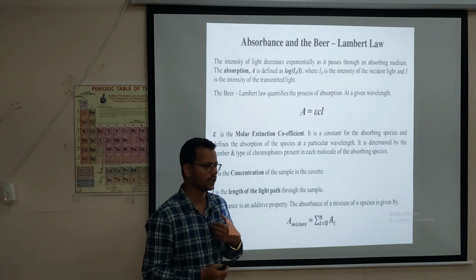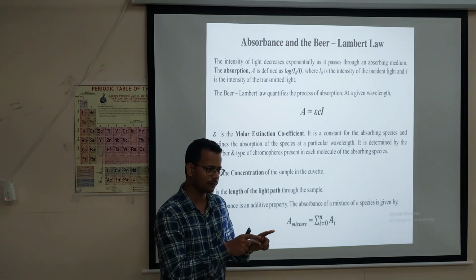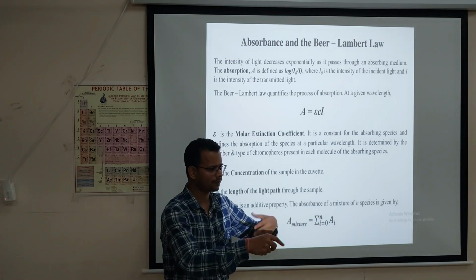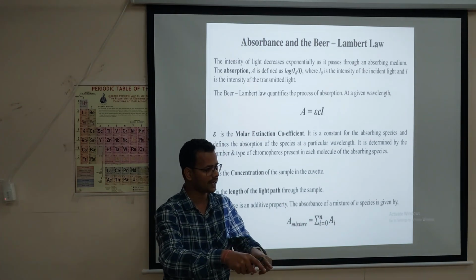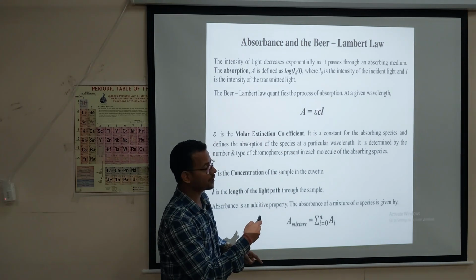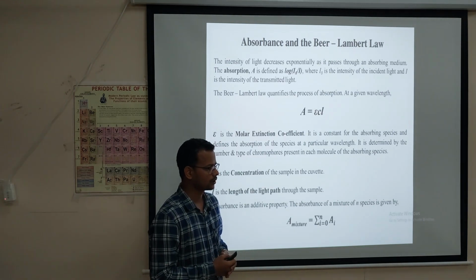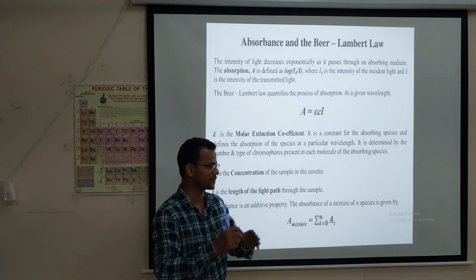Suppose I take a 100 ppm solution, so I get the epsilon value from that one. After some treatment, that will be reduced or decreased. So to get how much concentration has been degraded, I put the same epsilon value to get the different concentration of the sample. No, that is fixed. The instrumentation setup is already fixed. We cannot change that.